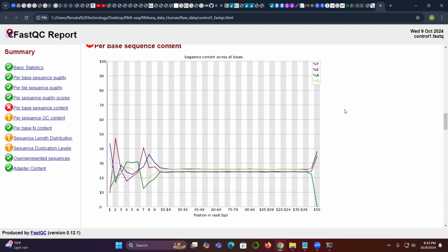At the beginning and at the end, yes, correct. At the beginning, you can see this random distribution, from 1 to maybe 15. Can you highlight that, Amit? From the x-axis below. Okay, now everyone can see the random distribution at the beginning and at the end, right?